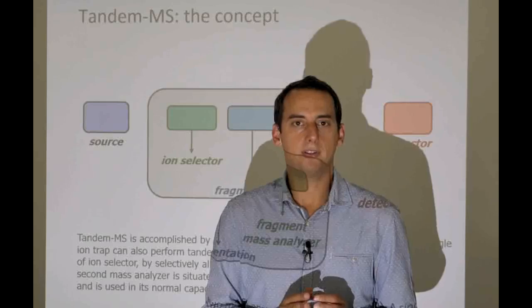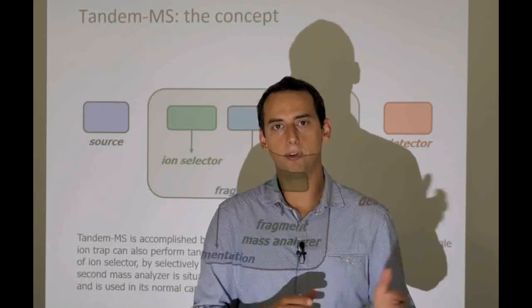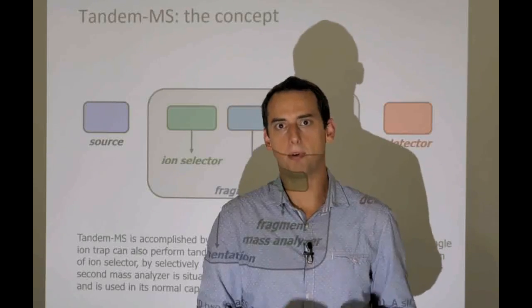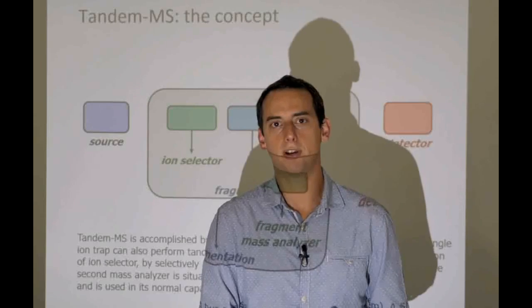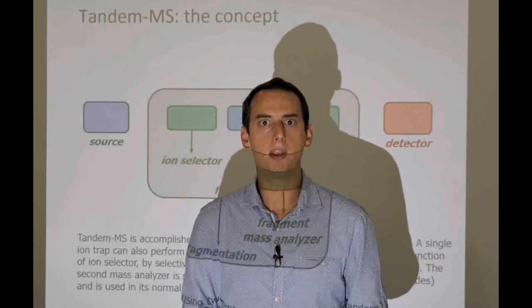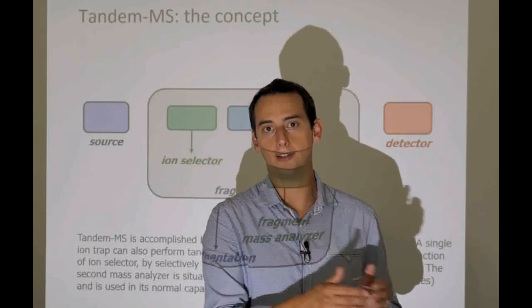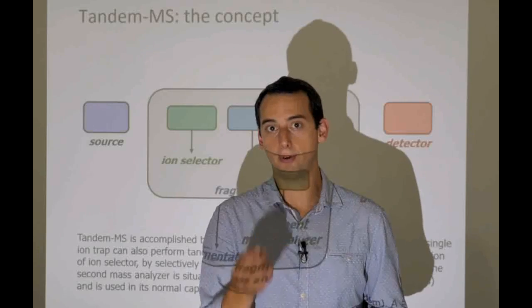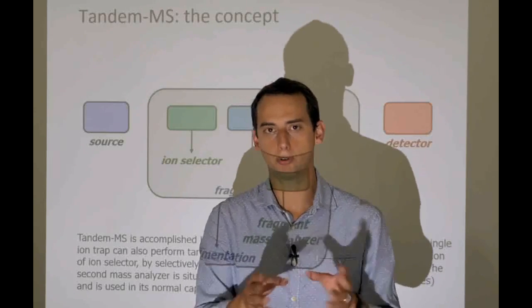What you can also imagine is, if we're going to go through with this very gruesome experiment and we would have all the students come in at once and we would chop them all up at once, we will have a giant mess to take care of. It would be very difficult to find out which parts belong to whom. It would be possible, but it would be tricky. So what we do is we put a bouncer at the door and we only let one student in at a time. In that way, we know that the fragments that we obtain come from a given individual. So of course, don't try this at home.